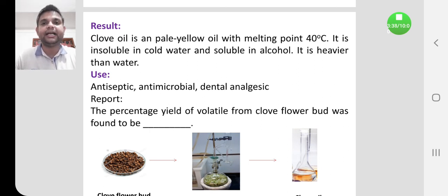After that, needle and pear-shaped crystals of sodium eugenate will appear in rosette shape. This crystallization test is one of the identification tests for eugenol. In the presence of sodium hydroxide, the eugenol present in the clove flower bud will be converted to sodium eugenate, which gives rosette-shaped crystals. These are the identification tests for clove oil.